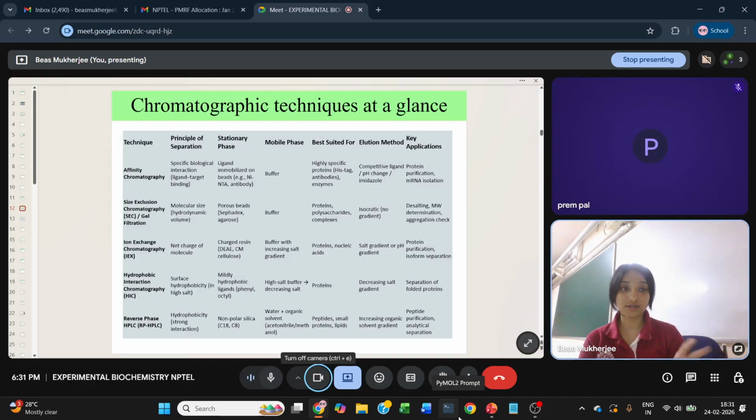So what is that biospecific elution or competitive elution? We will talk about this in details. So basically you know about this his tag, right? In the structure of histidine, it has a side chain, and the side chain is called imidazole ring. Now what we are doing is adding a lot of free imidazole in the buffer, and it is huge in number, and then we are flowing that buffer through.